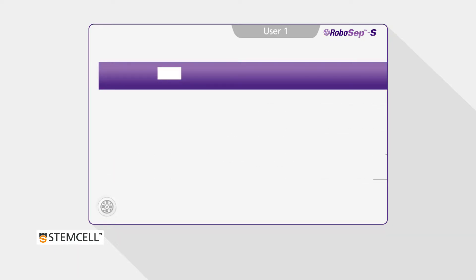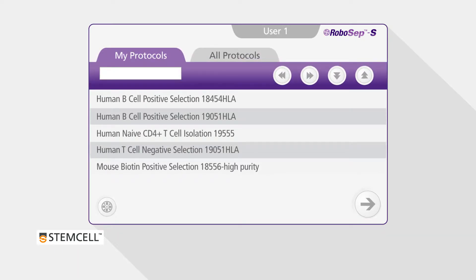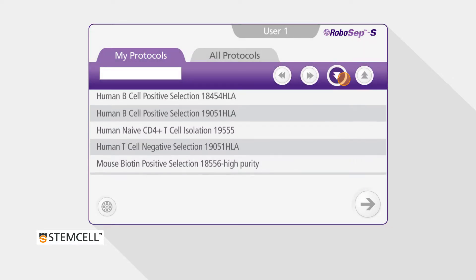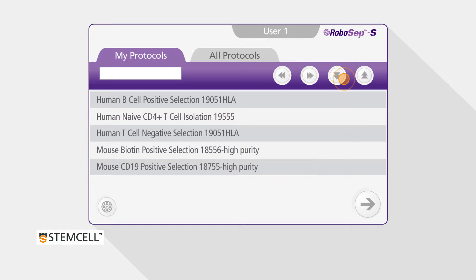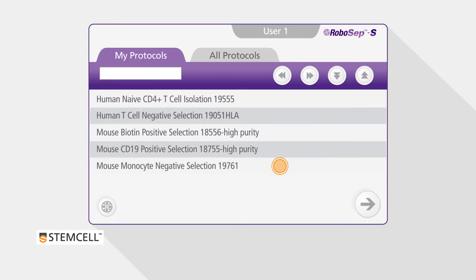Once you select a user profile, there will be a list of preset protocols to choose from. By using the arrow keys, you can easily navigate through the list until you find the desired protocol.